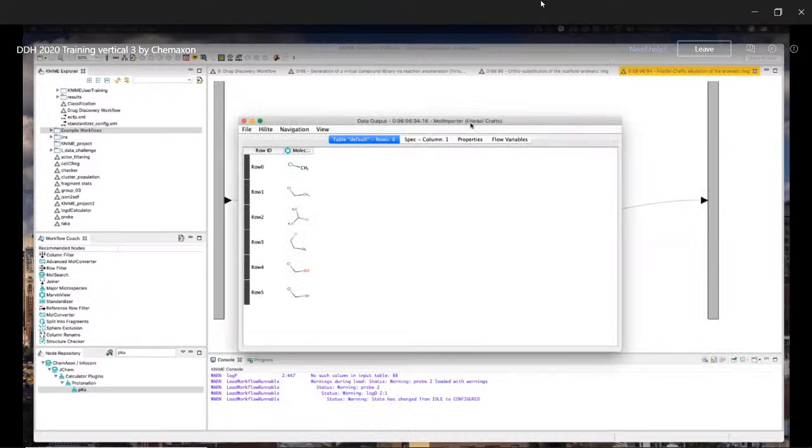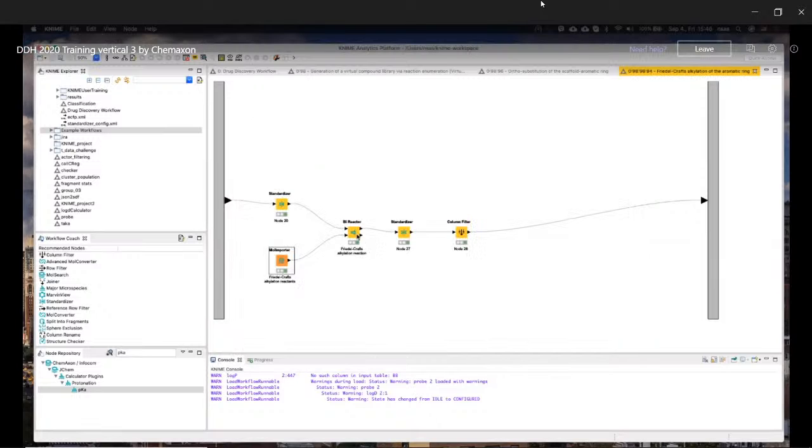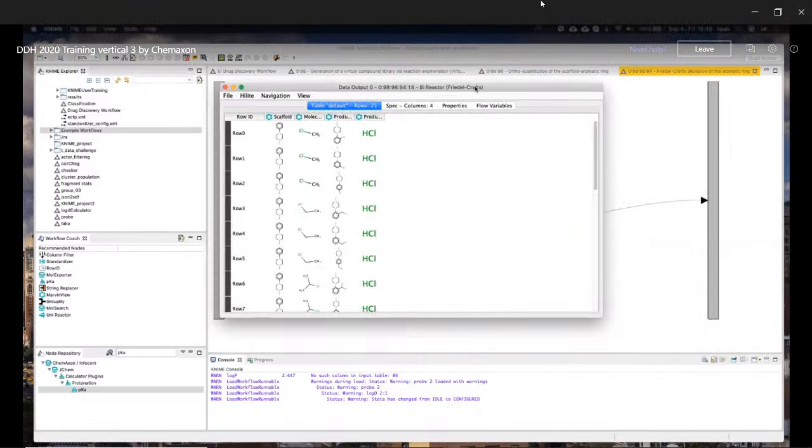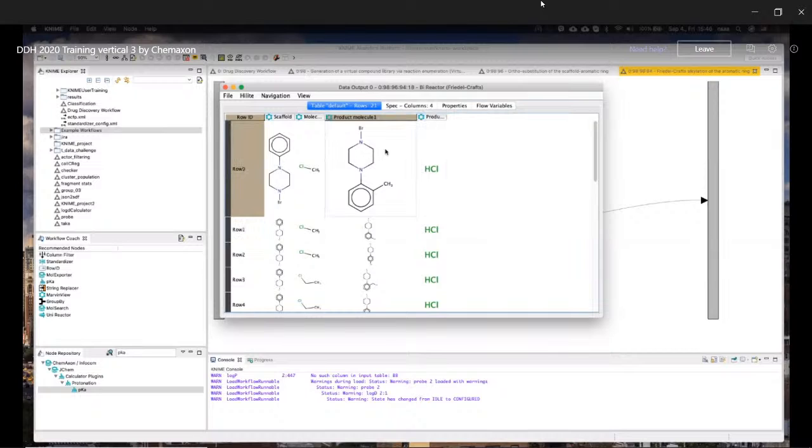But they are showing up in another. And those are chlorines. Very simple molecules. Again, we didn't want to complicate this one, but naturally, you can imagine that in the real world scenario, these reactants can go even wider than this one. Then we play the reaction. We have the two products in this case, naturally. And lucky enough, we have them in 2 columns, so it's easy to work with them. And then we have what we wanted.